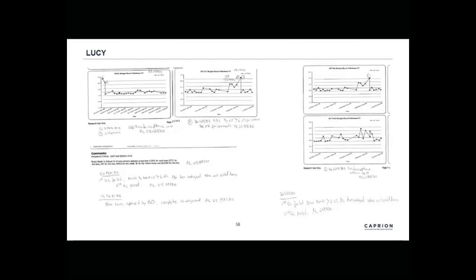So you can then show an auditor, you can prove that, yeah, Lucy was not used unless the CS&T were within the acceptability criteria ever. You can easily document that, reconstruct the data. And you can also use these data to show your service engineer, and that will give the service engineer a lot of information to help diagnose what might be the issue with Lucy and get her on the right path.